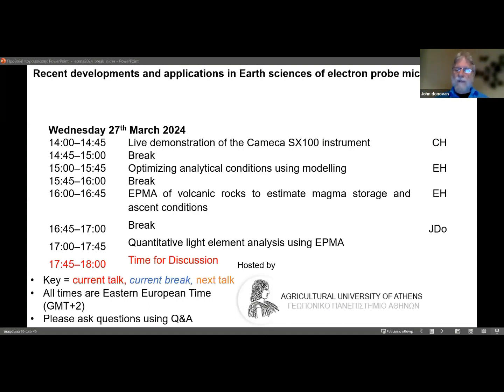And that's why we were able to demonstrate, we were at, I think, 100 or 200 nanoamps and counting for 200 or 300 seconds. But we were getting a t-test, 99% confidence of 2 to 3 parts per million of titanium in quartz. Now, other elements won't maybe be as good. Titanium is a very nice, robust energy emission, not too much absorption. And quartz is relatively beam stable if you defocus the beam a little bit. And so there's no problem there.